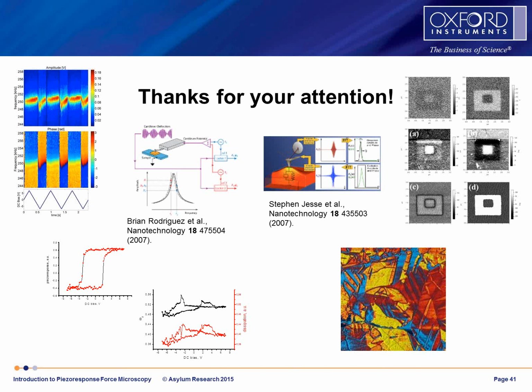If we start to lower the frequency, then somewhere around 10 kilohertz, we will start to see the very rapid onset of electrochemical reactions, meaning whatever you can come up with, the gold from cantilever dissolving and redepositing on the surface, bubble formation, and so on and so forth.